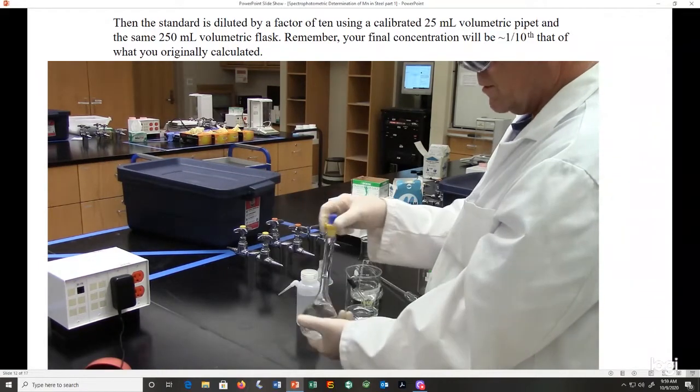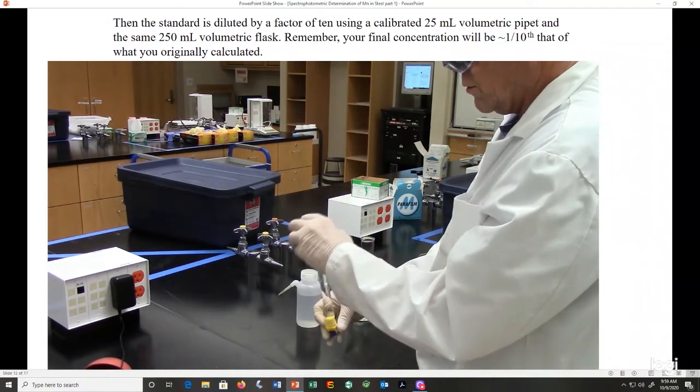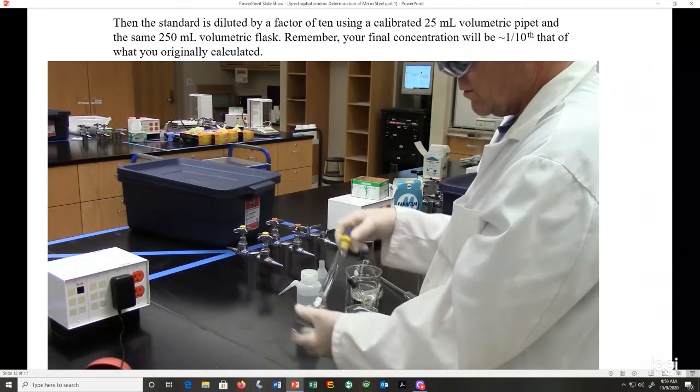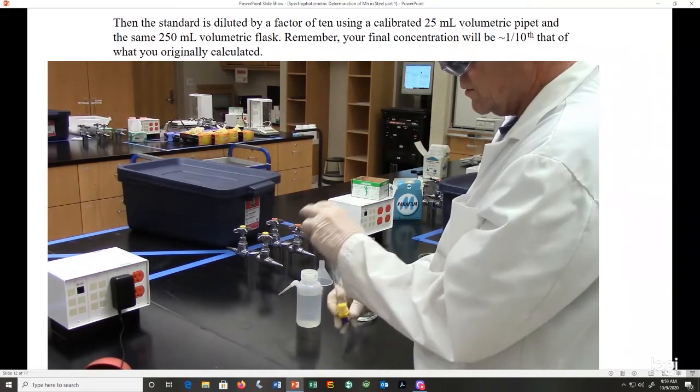It's always important when we're getting standards that are in volumetric flasks.